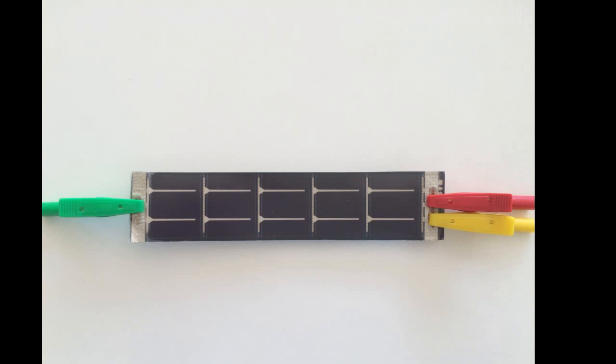You can then connect the potentiostat to the solar cell with the electrode cable. You can identify the positive contact by these patterns, so you should connect the working electrode, the green clip, on the positive side, and the yellow and red reference and auxiliary on the negative side.